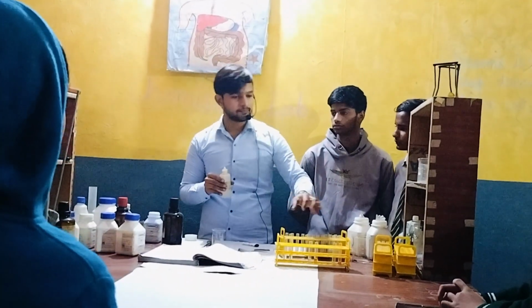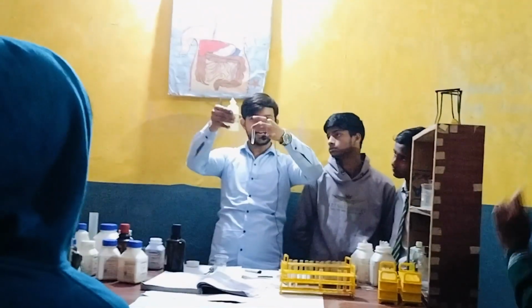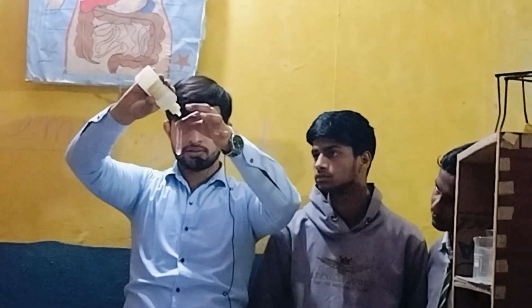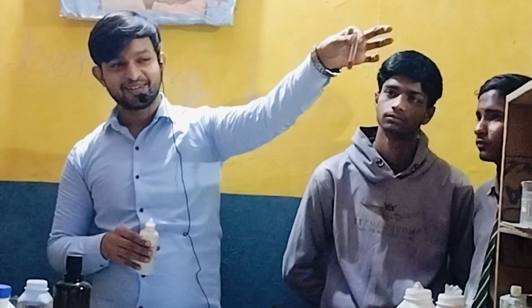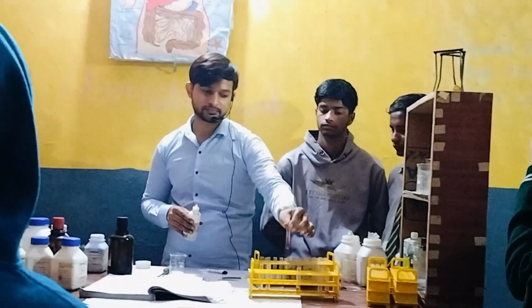Let's see. See, this is base. This is white color phenolphthalein. Please zoom it out and see everyone. The color changed. Yes. It confirms it is what is this? Base. Now let's do the same experiment with acid.